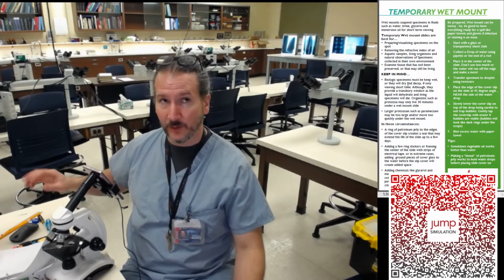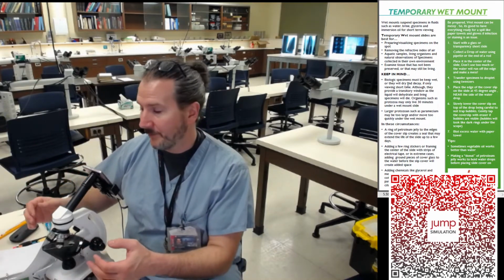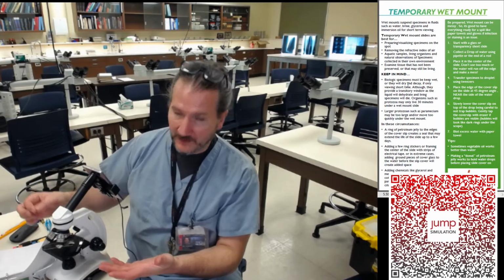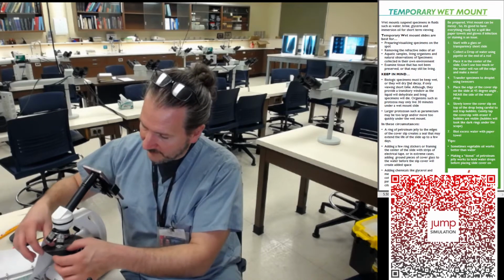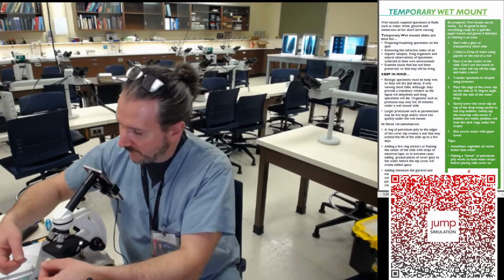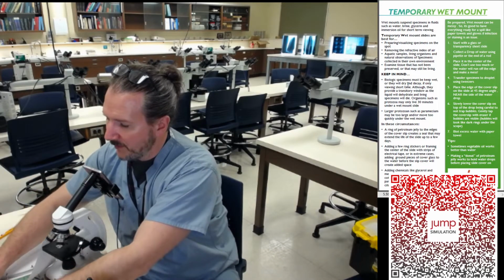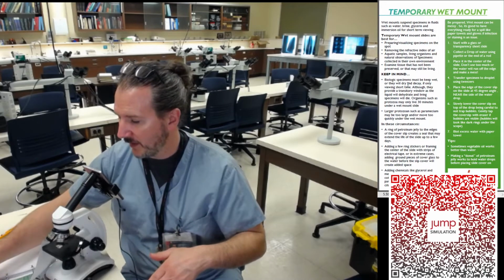Don't add distilled water to them. Add the same kind of water that they were with to it. And then with staining, we talked about it before, you can put a drop of stain right on the side of the slide with the water, and it pulls the stain right in. I'm going to pull this off. I'm actually going to, I'll put it here. But I'm going to take a piece of tape and I'm going to tape my shaving down to my page so that my notes stay with it.